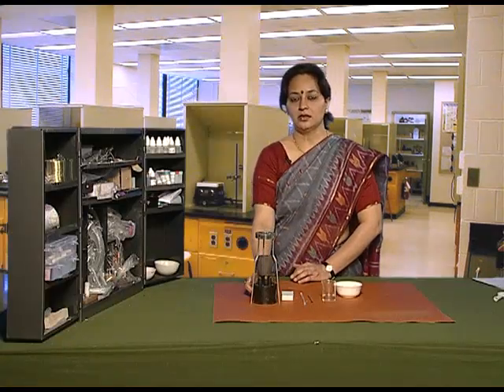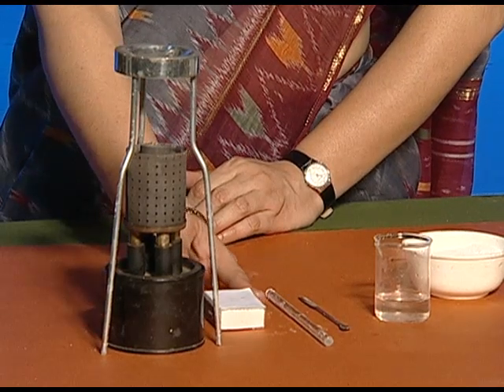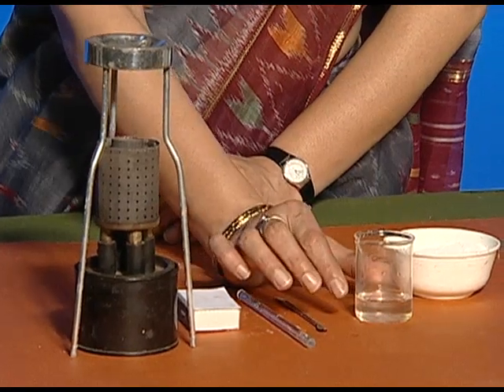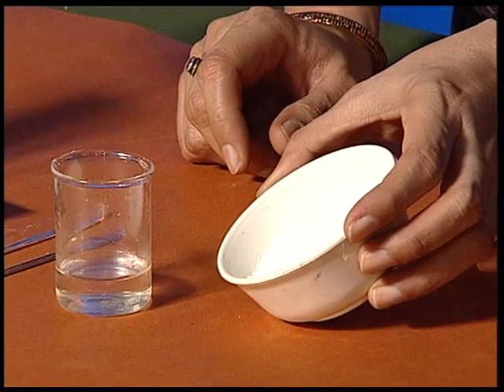For this, we need a tripod stand, a kerosene burner, a matchbox, a stirrer, a spatula, and a beaker containing water and common salt.